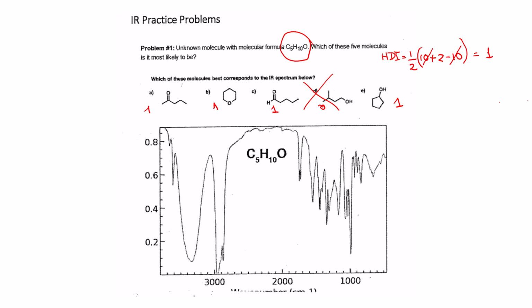Now, inspecting the spectrum, I'm going to draw that line. Well, it wasn't straight, but right here in this region is alkane type, so carbon is sp3, and the hydrogen is attached to an sp3 carbon. But this band here is an OH, with hydrogen bonding, and likely this is also OH.